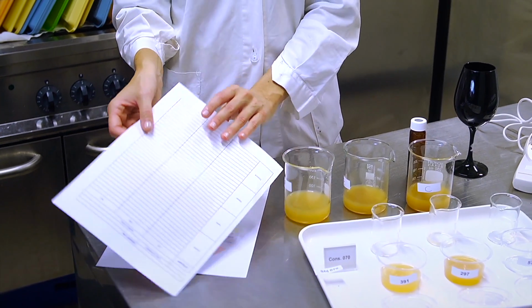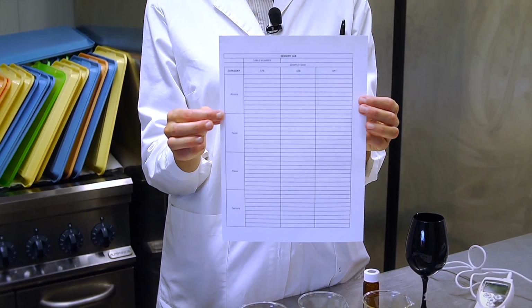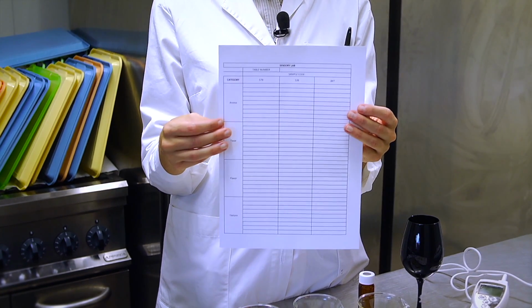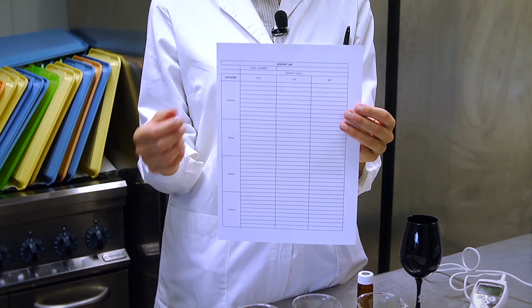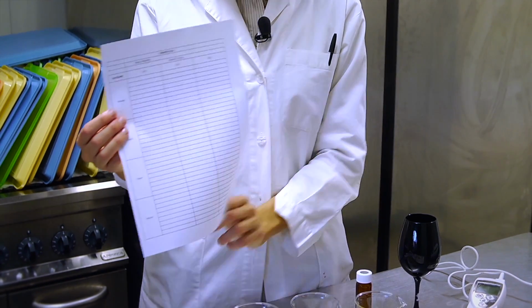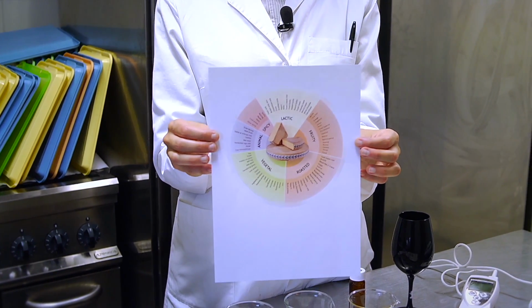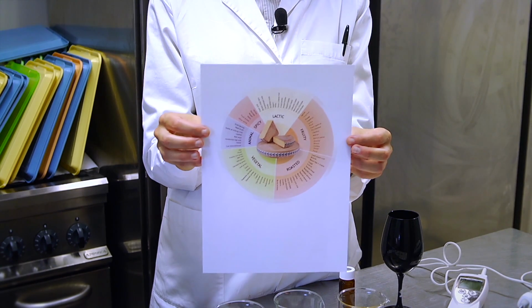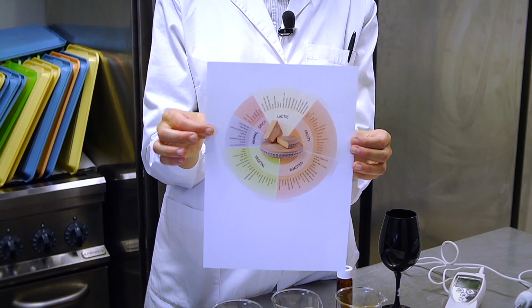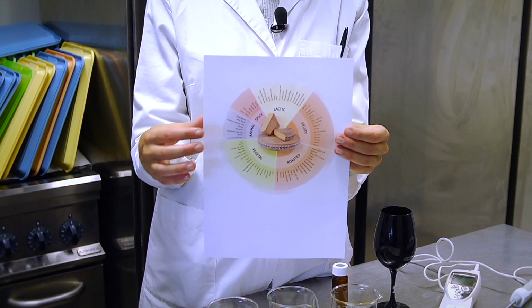Instructions can be delivered in the shape of an evaluation scorecard, like this one, that explains how to conduct the sensory evaluation, for example, evaluating the aroma, the taste, the flavor, and the texture. Or it can be a more complex scorecard and flavor aroma wheel, like this one, used in case of descriptive tests, in case of a longer activity, for example with a panel.